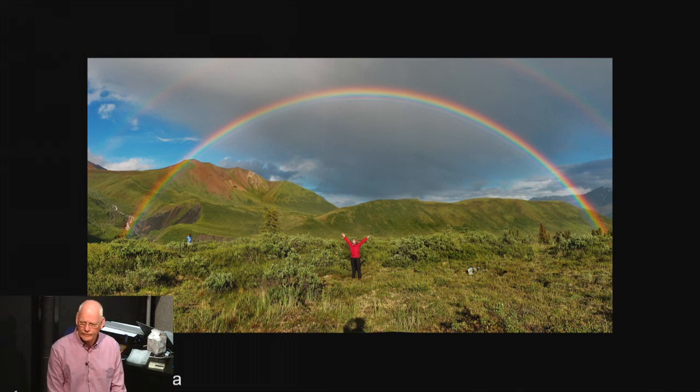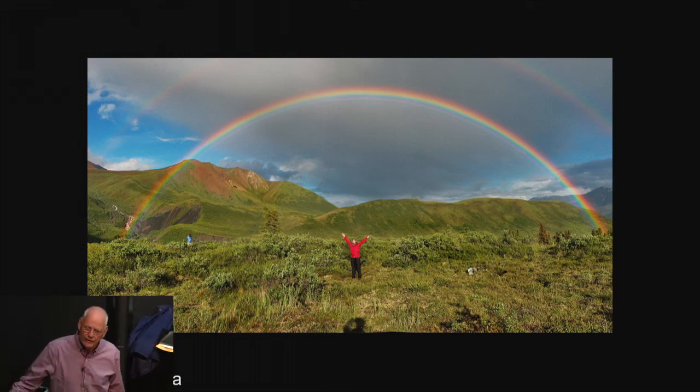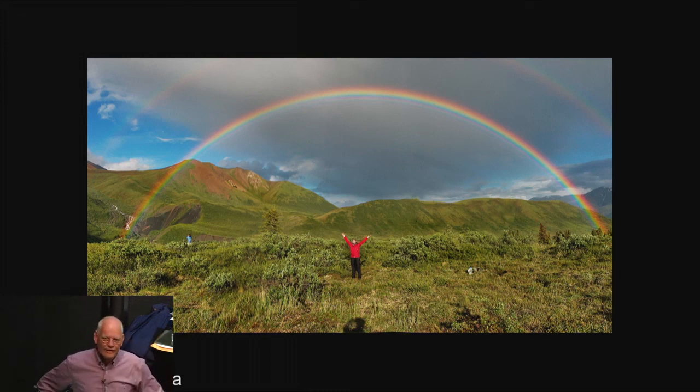Mm-hmm. So you mentioned with the field camera that you take a hit on spatial resolution, which makes sense. In fluorescence microscopy, there are various statistical analysis techniques to recover spatial resolution at the cost of, say, temporal resolution. Is there an equivalent in polarization microscopy?